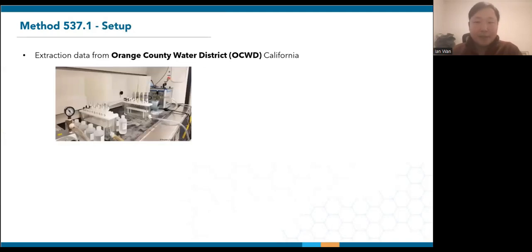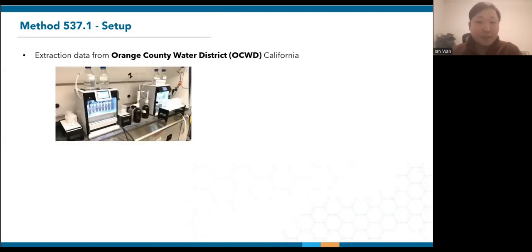Space is often a scarcity in labs, making it difficult to accommodate large equipment. Shown here is two of the original manifold setups at the Orange County Water District. Fortunately, the compact design of the SPE03s allowed for a simple drop-in replacement.